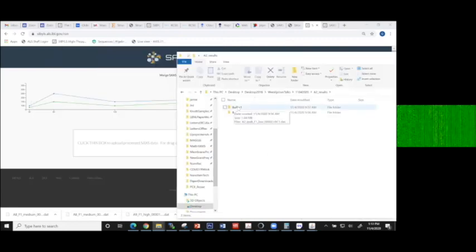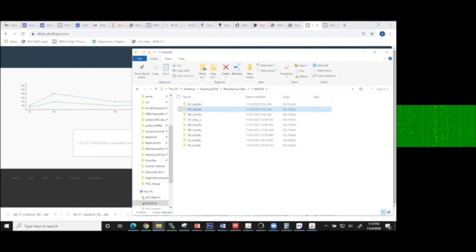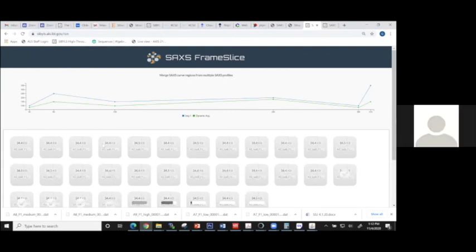So here is, let me work with the medium concentration. And again, you would want to do this for all concentrations and compare all concentrations. So I'm just going to pull this over here and just do buffer 1 of the medium concentration. Correct, 2 minutes. All right, I'm working on it.